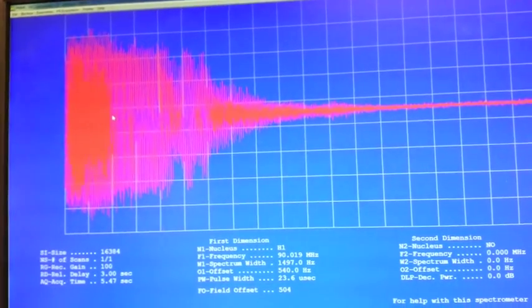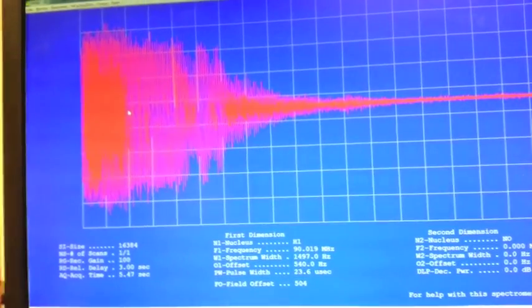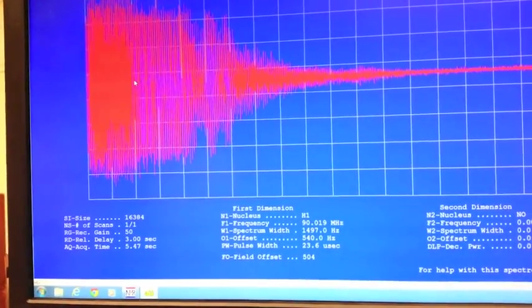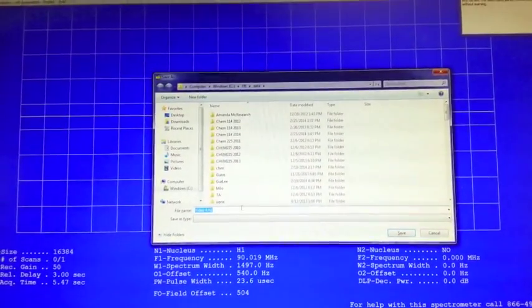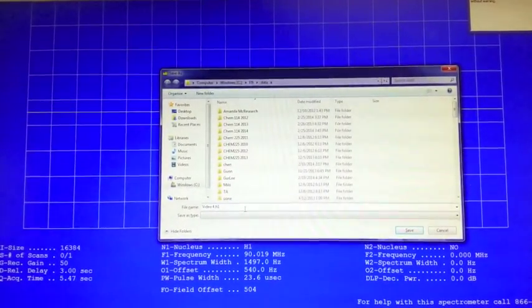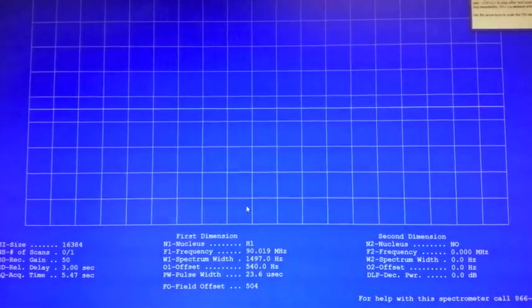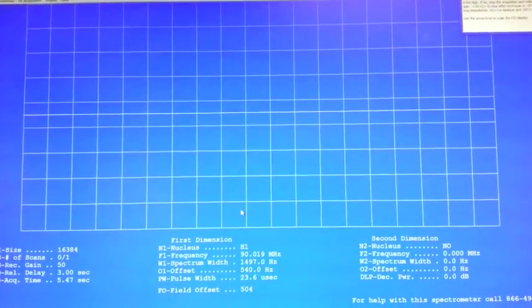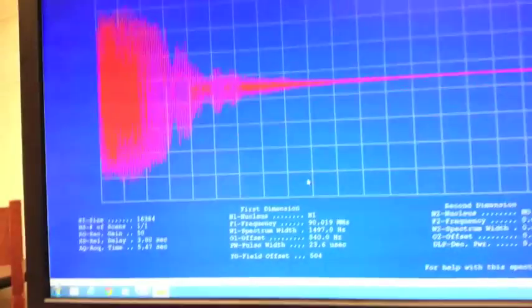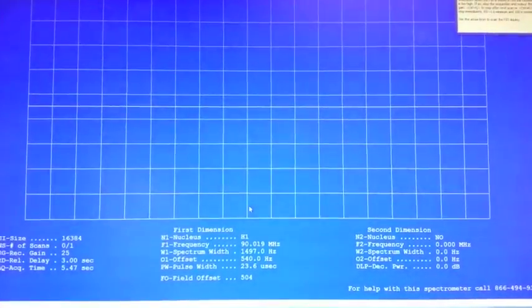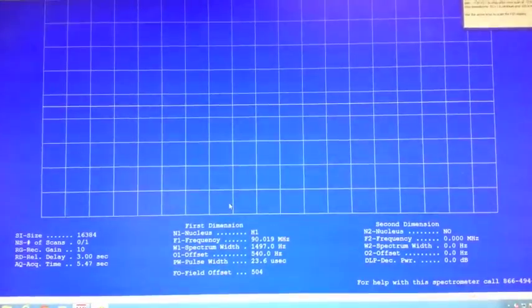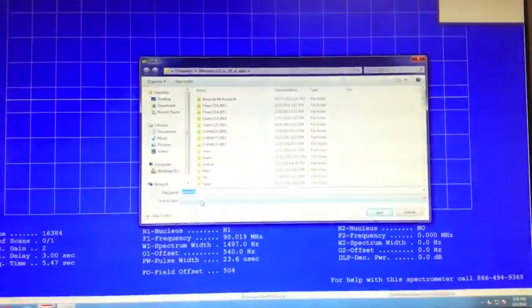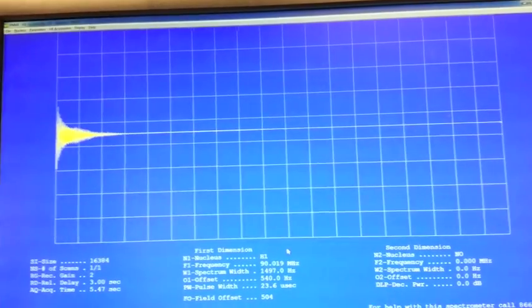If your scan turns red, that means the receiver gain is too high. That looks really high to me, so I'm going to change the receiver gain again to about 50 and see how that looks. Anytime you're saving over your old file, you want to get rid of the .h1 or .c13 at the end of it. Otherwise, it will create a new file. It's still red, so it's still too high. Let's try that again.